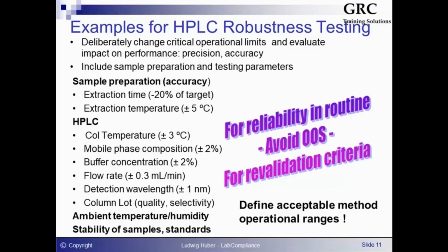Now here I have a couple of examples and the definition for robustness testing, which is very important. Robustness has been defined as a measure of the method.